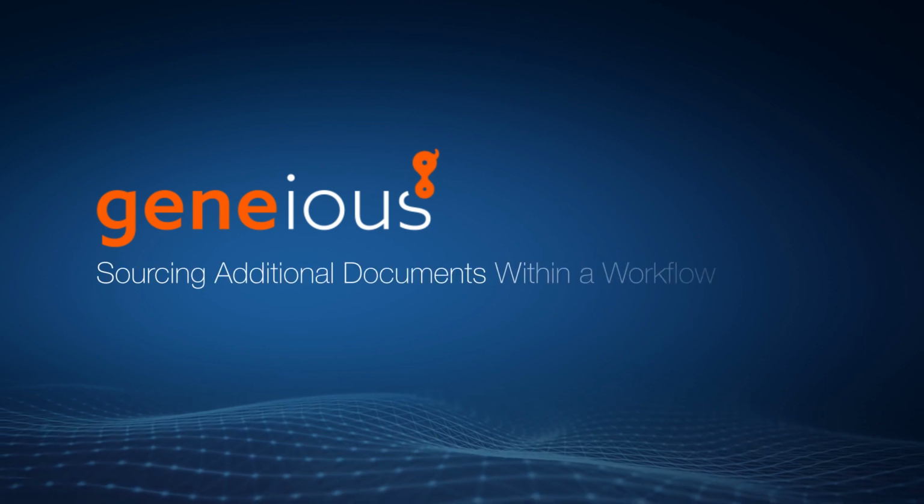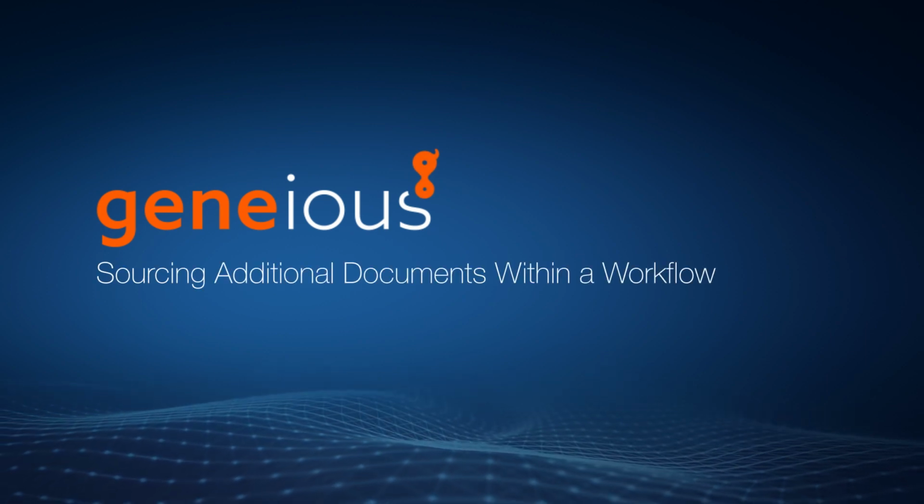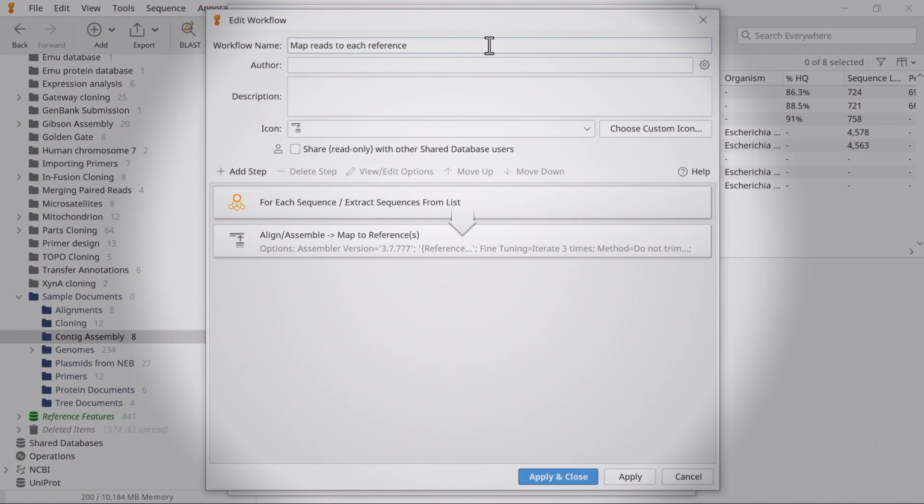Let's now look at how to source additional documents within a workflow. Sometimes you may want to add documents in between steps in a workflow. For this example, I want to prompt the user to select the sequence files before starting the workflow, which involves mapping reads to a reference sequence.